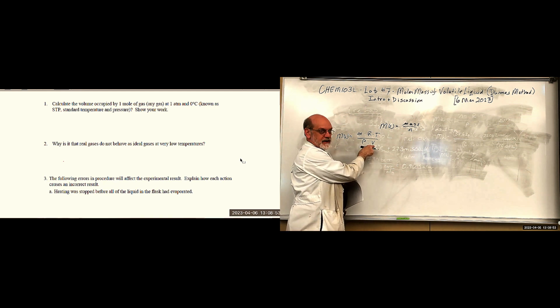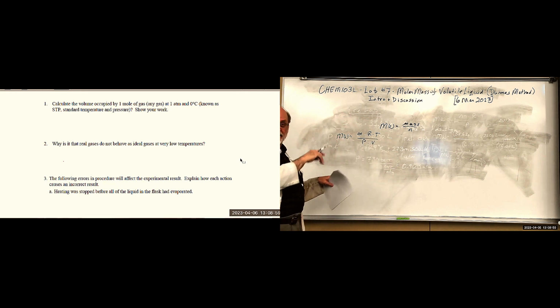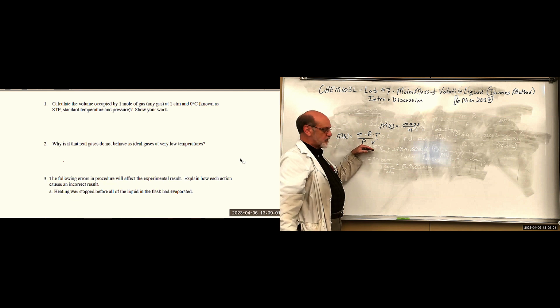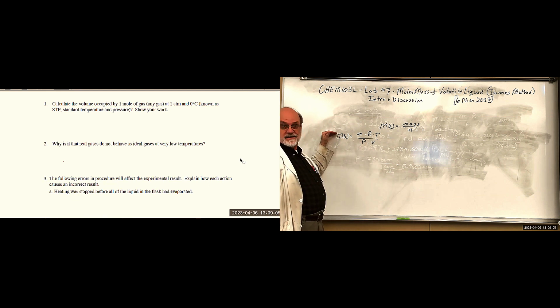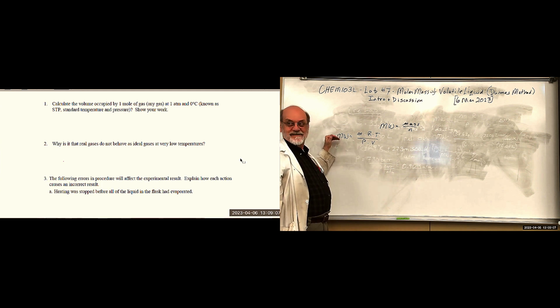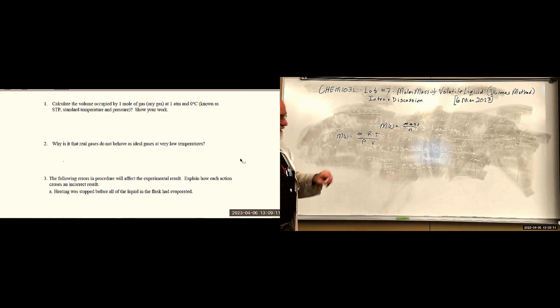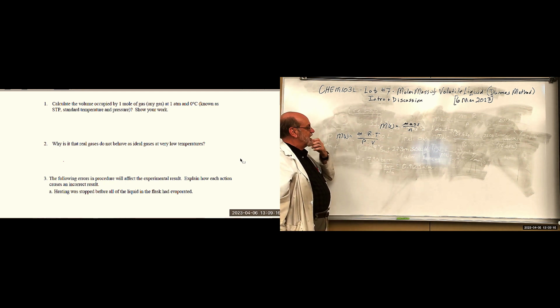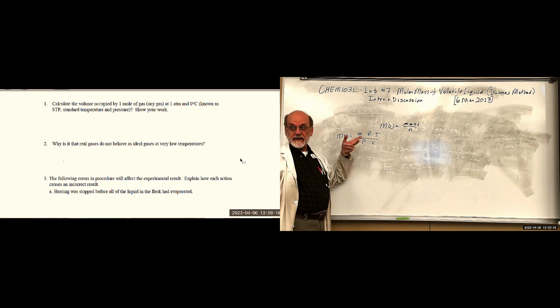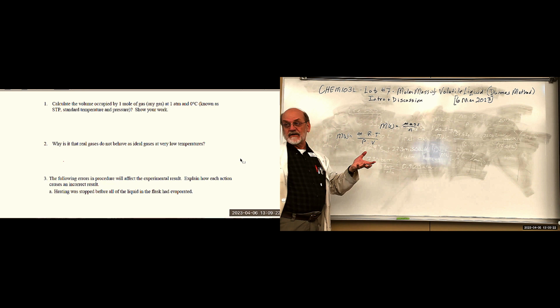This is in the denominator. If you put a value that's lower than it should be here, yes, right? When the denominator is lower than it should be, the quotient value is higher. If you have two factors going on at the same time, if you have lower here and higher here, it depends.